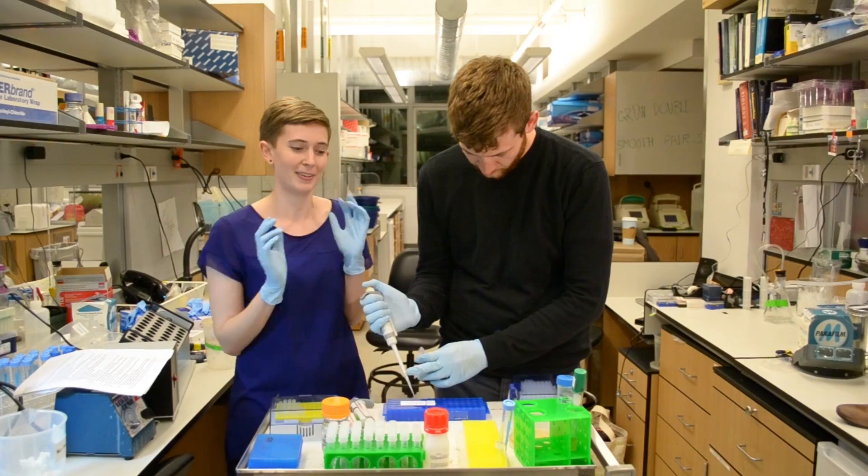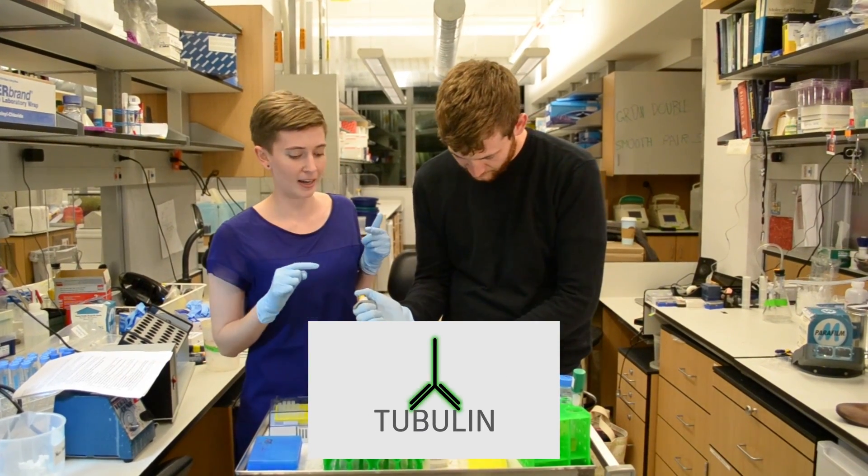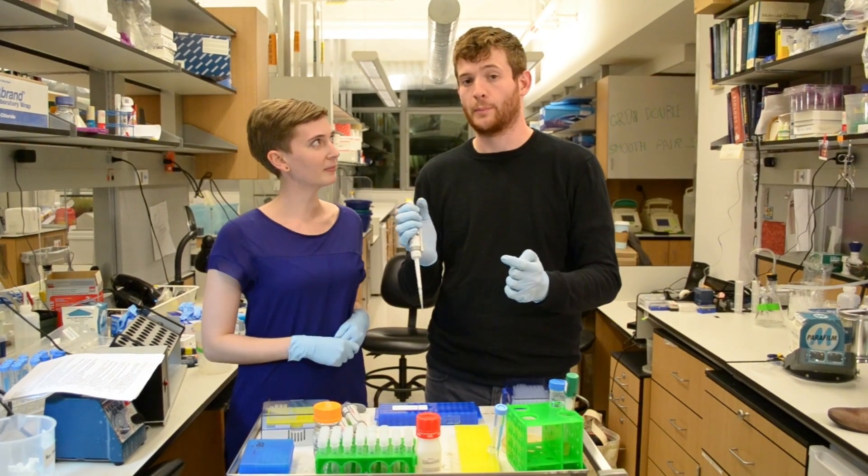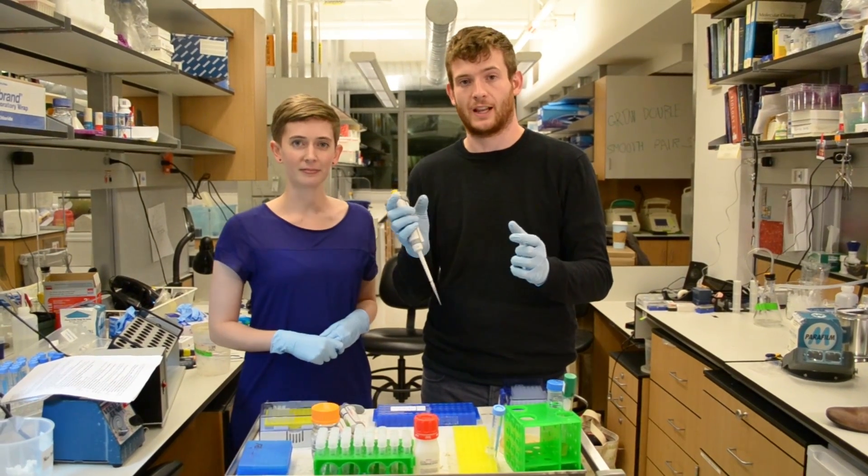This antibody is tagging tubulin and we can look at the tubulin on a microscope. Tubulin is really important because it's a protein that's part of the skeleton of the cell that helps provide the structure that pulls the cells apart.